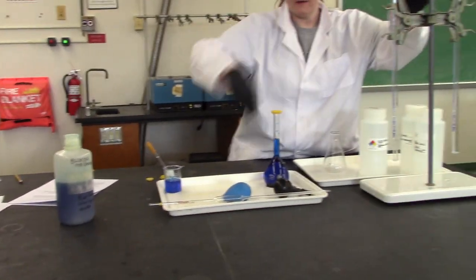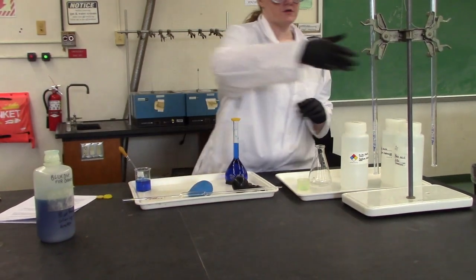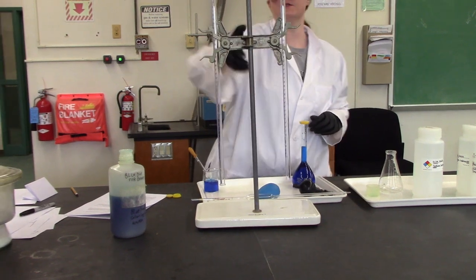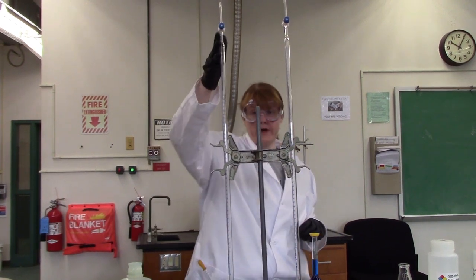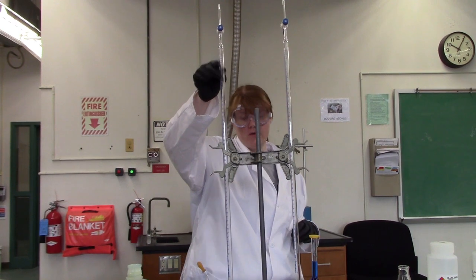So the burets are located on the side bench near where you usually pick up your chemicals, okay? And they're stored like this. They're stored upside down with the stopcock open, and that's because when you finish, you want to clean it and then leave it to dry thoroughly. If this is closed, it doesn't dry very well, okay?